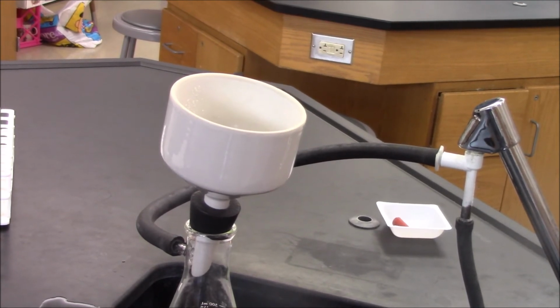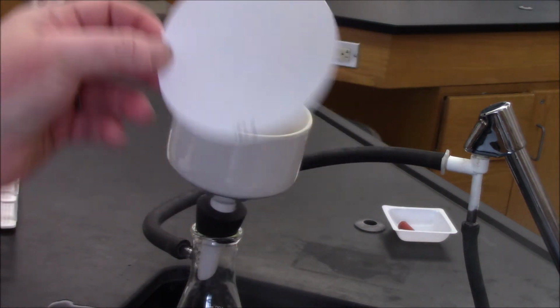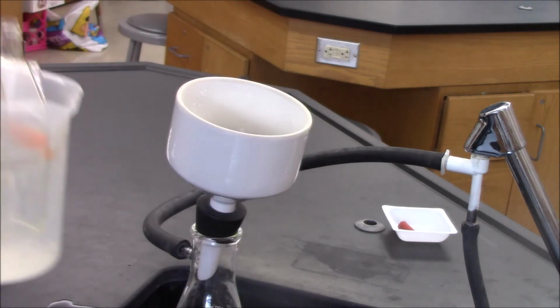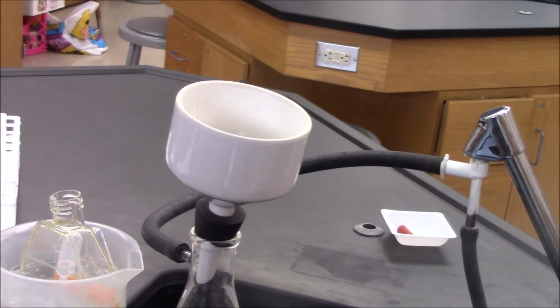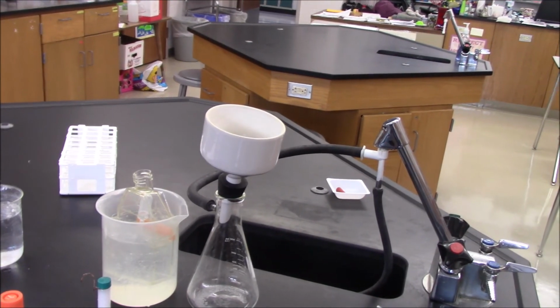All right. So to start, I have a new piece of filter paper, and I've measured the mass of my filter paper to be 0.62 grams. I'm going to go ahead and put it in my funnel. I have some water, which I put on ice. I'm going to be using that to rinse. And I think I'm going to try to maybe zoom out a little bit so that you can see a little bit more of what I'm doing while I'm doing it.